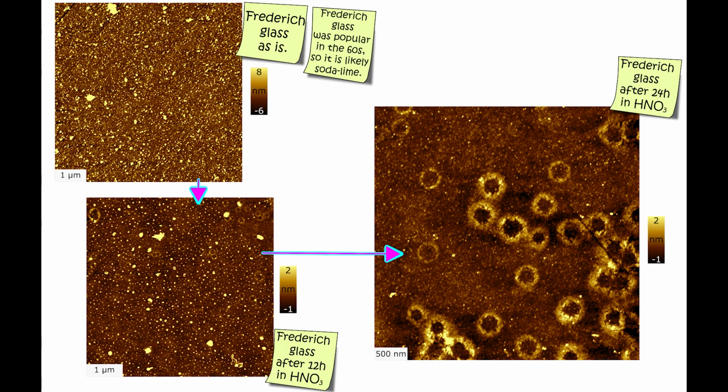Last but not least, we have the Frederick glass. I found it in a flea market. Well, I don't know the story, but this thing was out since the 60s, so it accumulated a lot of contamination, dirty scratches. So I washed it a couple of times, but still I was seeing an image that was covered in contamination. So I thought I was not going to be able to get anything out of this.